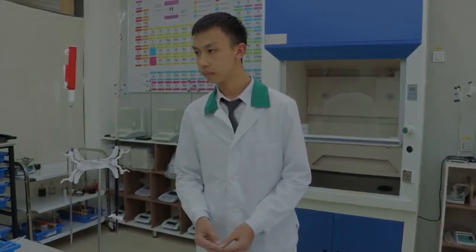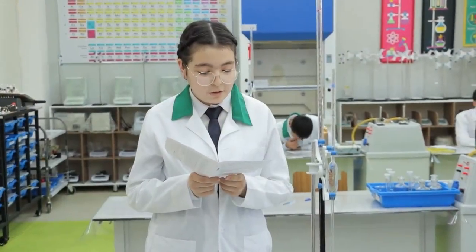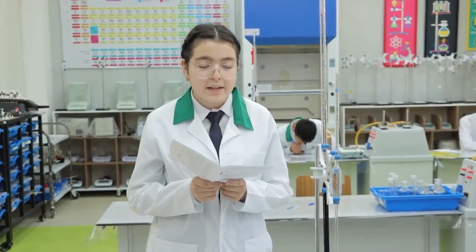Excellent. Okay, that's good. Yes, Husanara, how did you analyze your salt by qualitative analysis? How did you identify your cation and anion? In experiment 3, we have to determine the cation and anion.